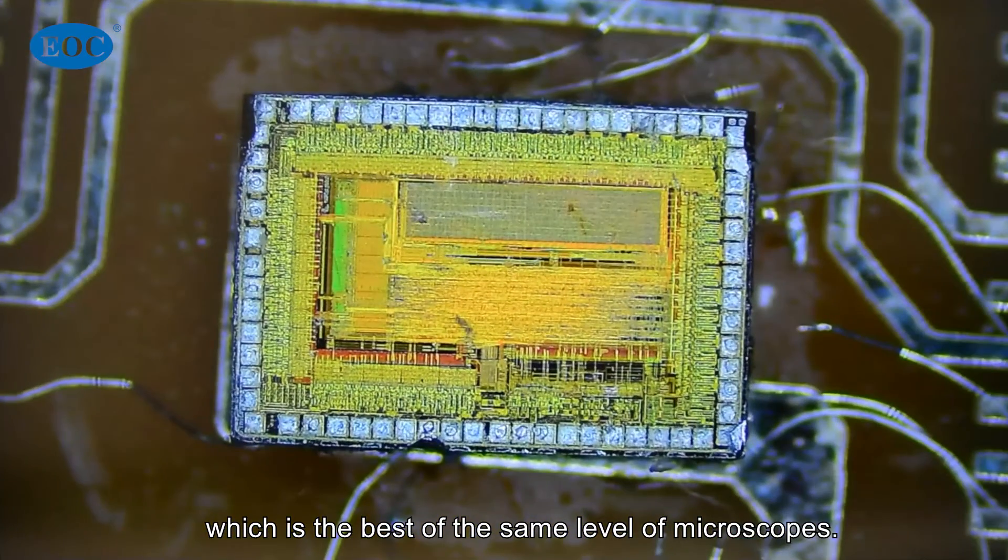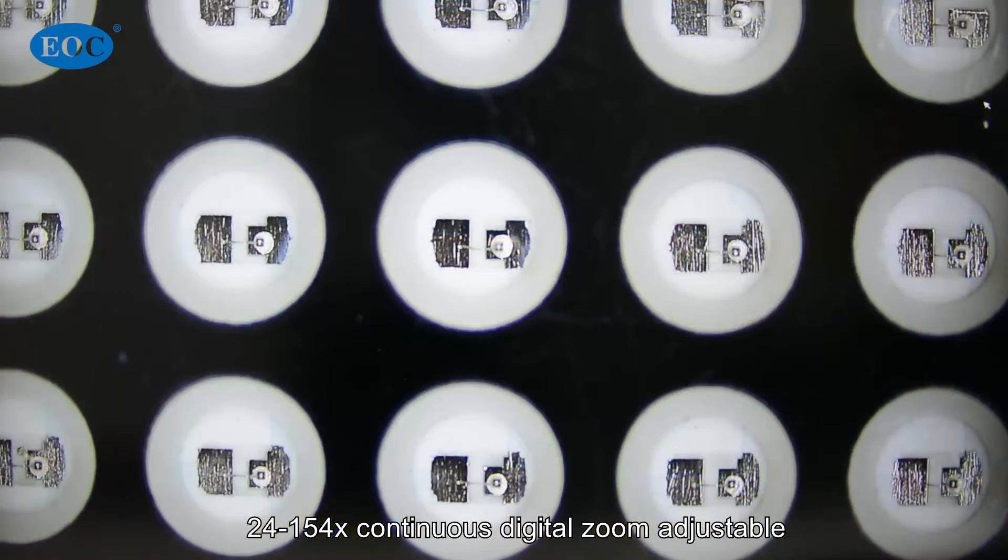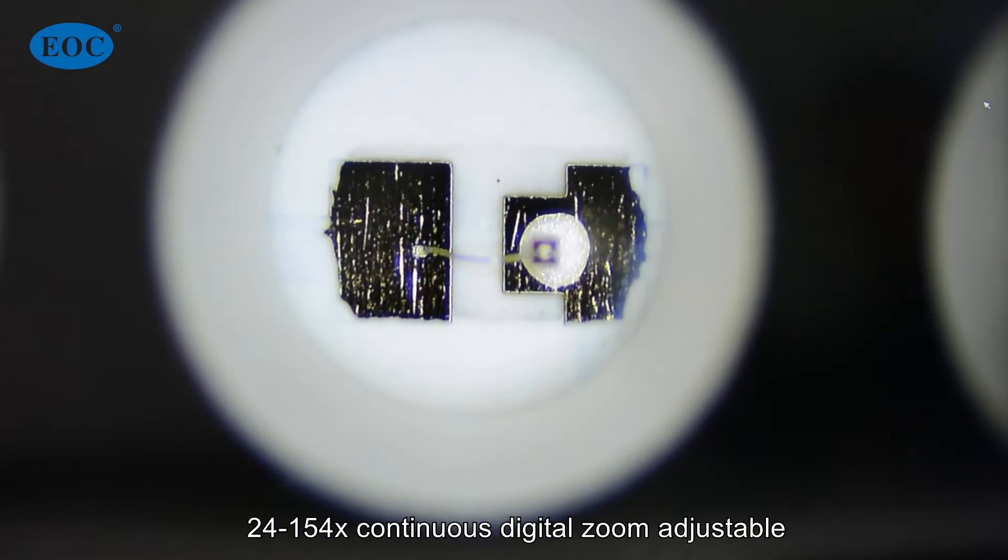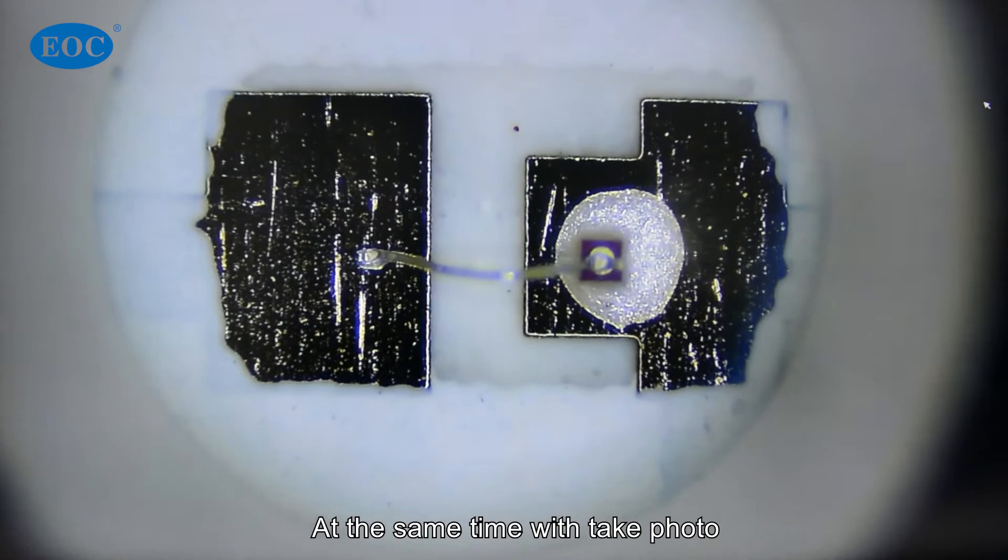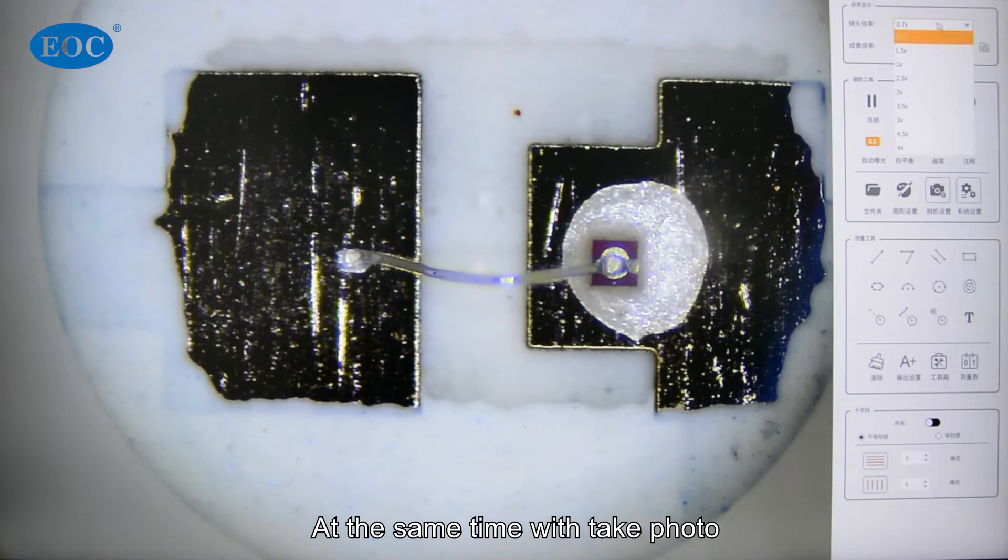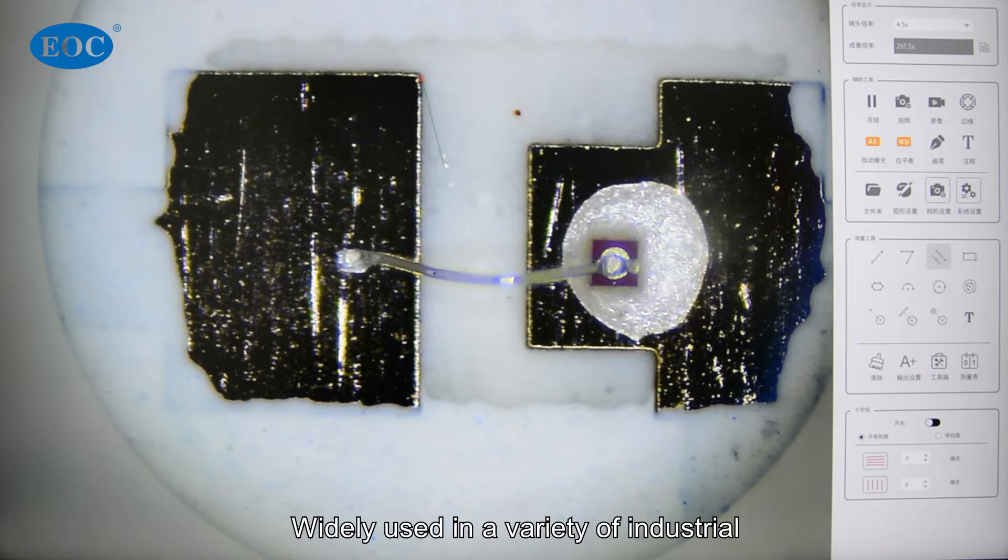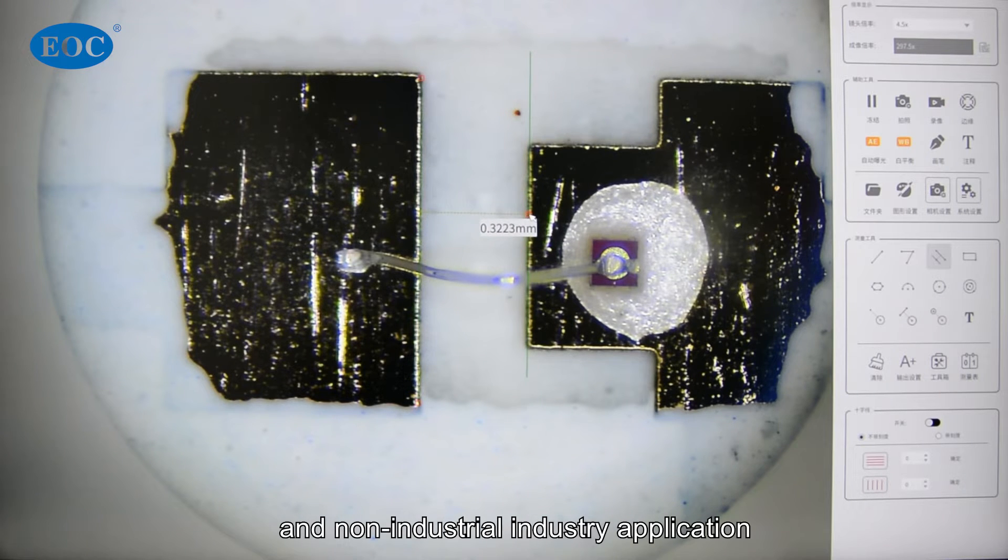It features 24-154x continuous digital zoom adjustable, with photo, video record, and 15 types of plane measurement functions. The microscope is widely used in a variety of industrial and non-industrial industry applications.